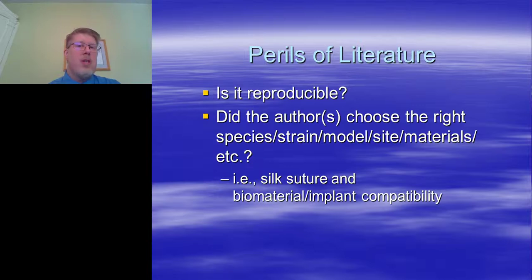So if I close an incision with the most reactive suture material, as far as I know, in the entire field, silk, I've completely destroyed my histopathology. It's completely affected. Any effect that I might get from my implant or my biomaterial or my injection at that site is probably masked by the fact that I have a hyperacute inflammatory reaction just based on the suture I put in. And to this day, I see that in papers. So don't assume that they did things right.